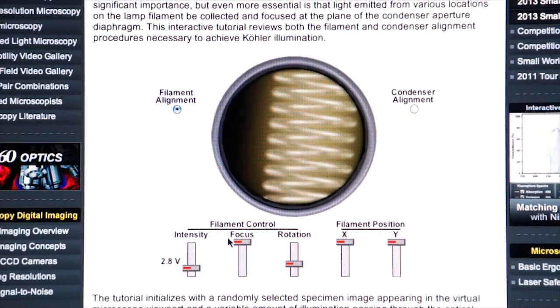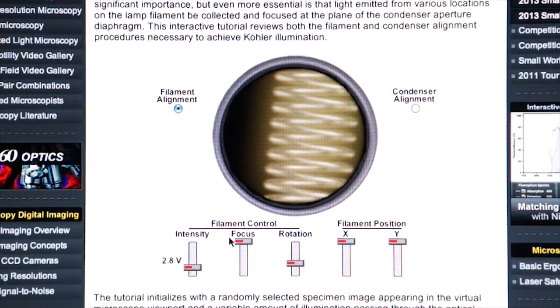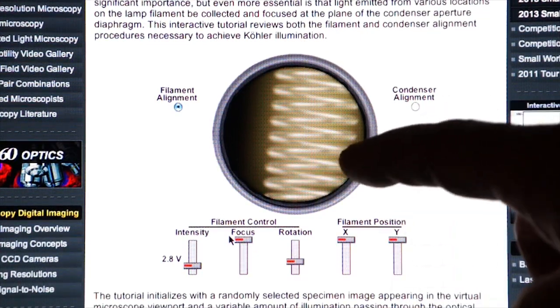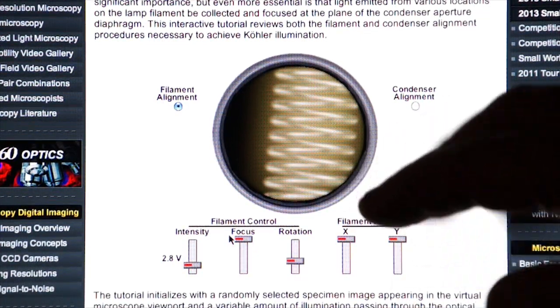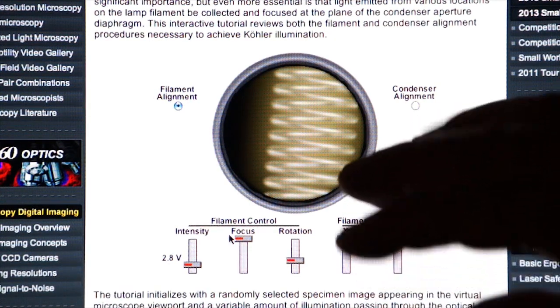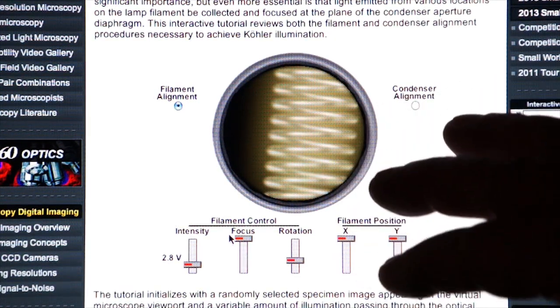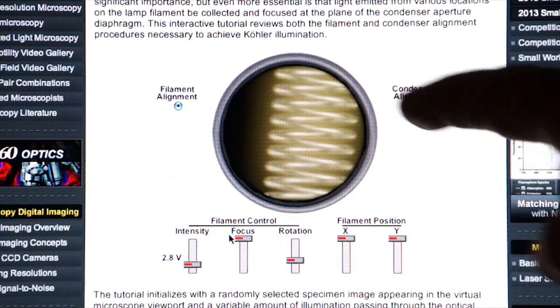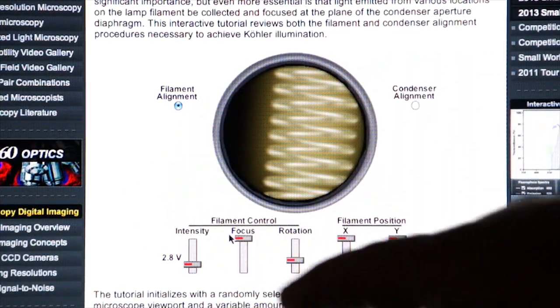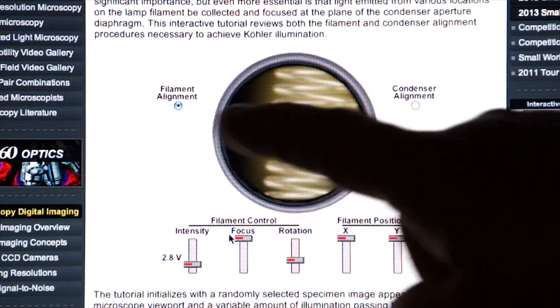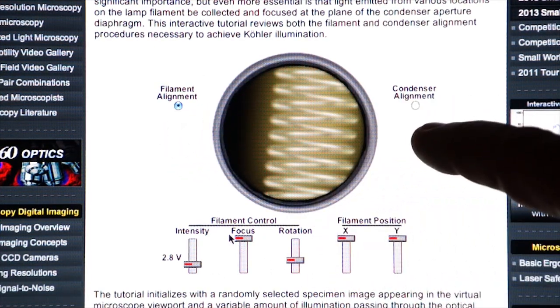In discussing Köhler illumination, it's important to understand how the lamp is affecting your image and how the condenser is centered to the optical path of the microscope. Here on Nikon Microscopy U, we have a nice tutorial under Köhler illumination that shows you both the filament alignment and the condenser alignment.